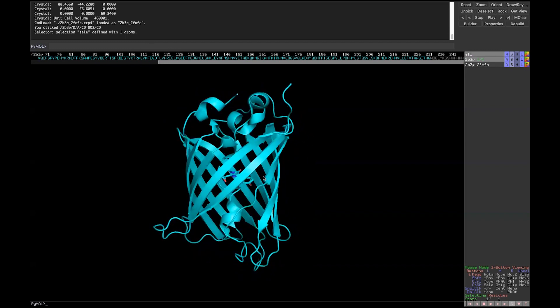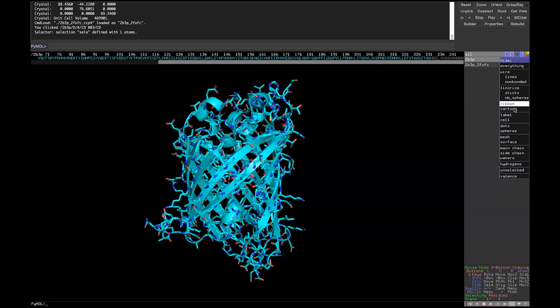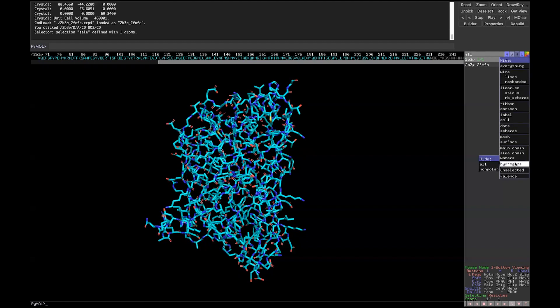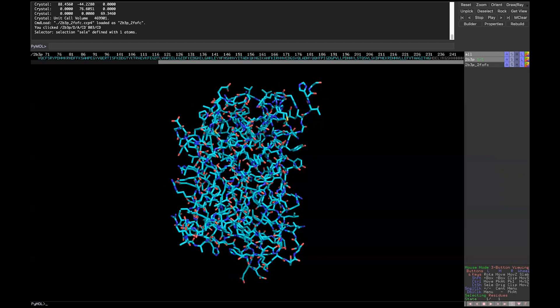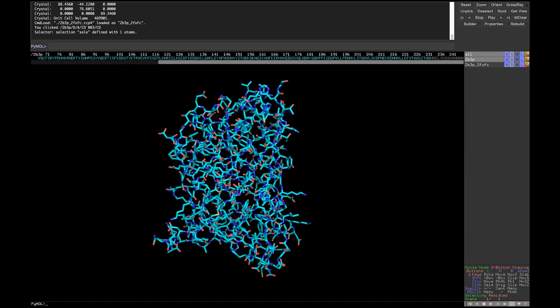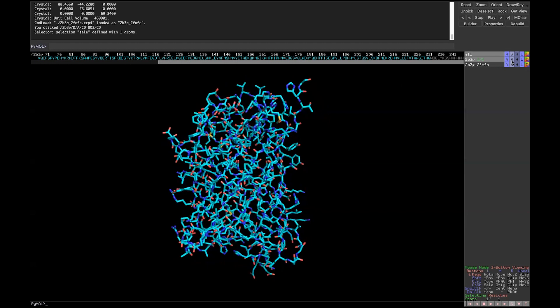Right now the protein is shown in cartoon mode. We can switch to a sticks representation using the Action menu. We're going to show it as sticks, hide the cartoon, and also hide the hydrogens and valence bonds to clean things up. The reason for showing sticks rather than cartoon is that when we're trying to fit into the density, we actually want to see the individual side chains rather than just the overall shape.